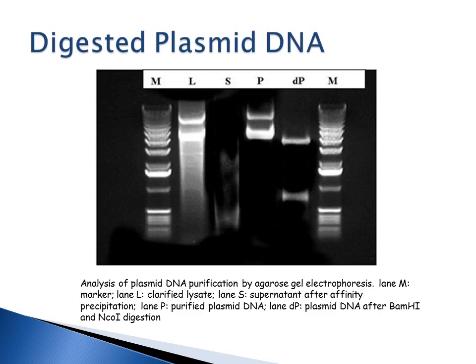Here again we have digested plasmid DNA. You have your marker, you have lysate. So remember we said crude lysate is a little dirtier. You're usually only going to use crude lysate to perform amplification techniques. If you were to take a crude lysate and run it on a gel, you're going to see it's very smeary because it's got a lot of other stuff, all that cellular debris in it. So you're not going to see a nice crisp band on the gel.